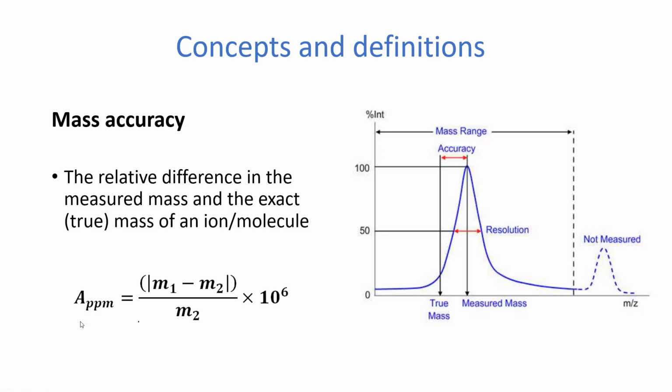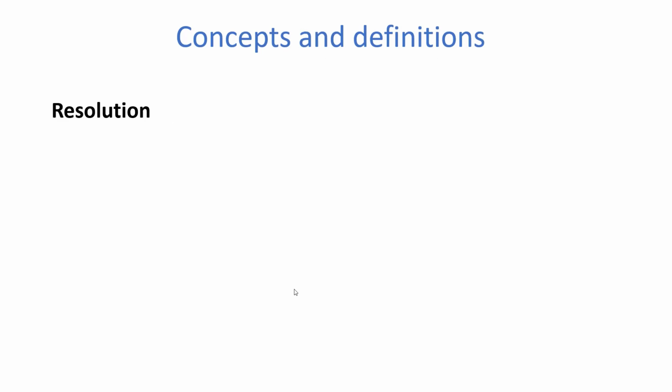So you hear a lot of people talking about, they won't even say mass accuracy. They'll just say my measurements were at blah, blah, blah ppm. And you might be kind of scratching your head because it's sort of a parts per million measurement because you multiply by a million, but it's not the same as, say, a concentration ppm because there's a difference implied in there.